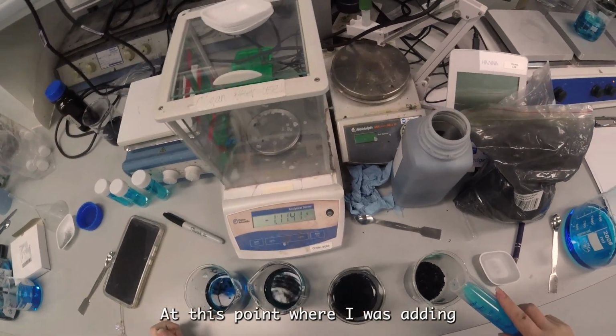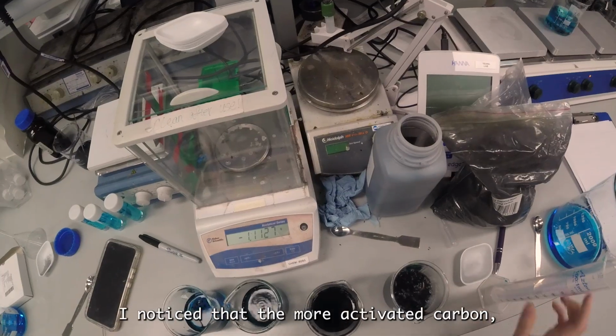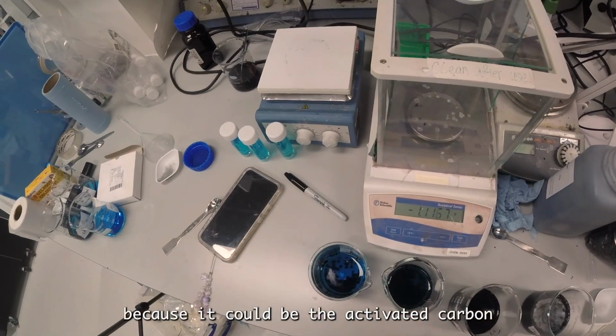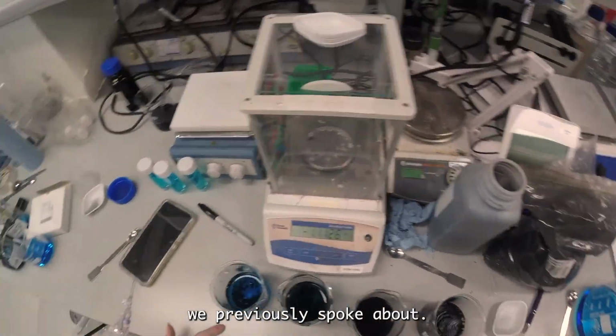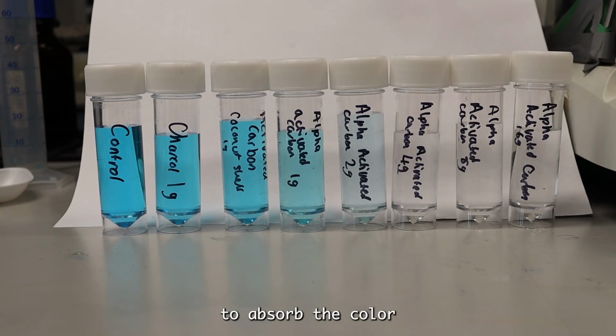At this point where I was adding the 100 milliliters of solution, I noticed that the more activated carbon, the more fizzing that happens when you add the solution. This makes sense because it could be the activated carbon getting rid of all of the air trapped in the pores that we previously spoke about. So after waiting for 5 minutes for all of these to absorb the colour molecules, I then filtered all of them, and this is the results.